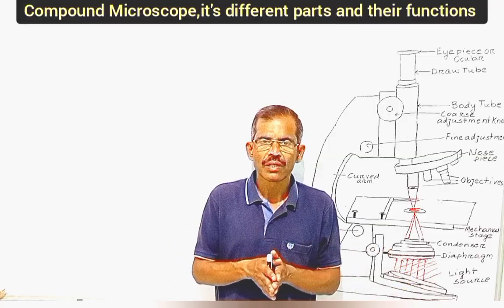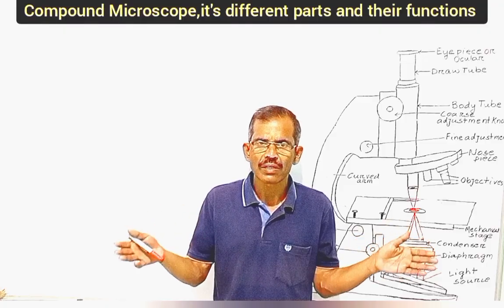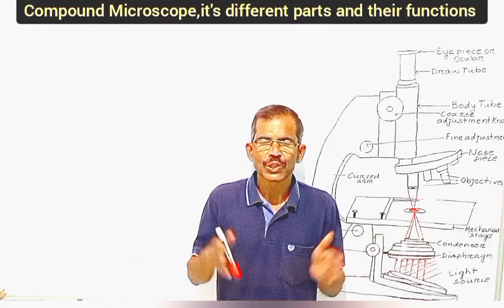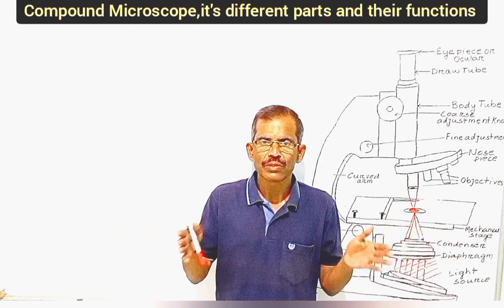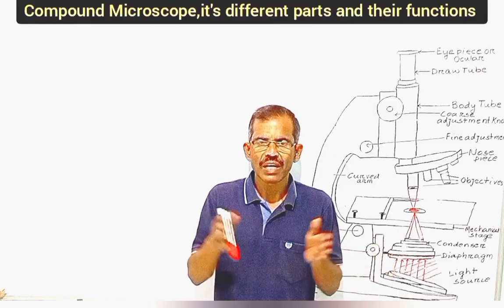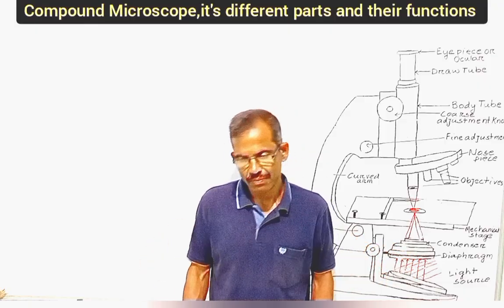In addition, in a phase contrast microscope, a phase plate is present behind the objective lens. This phase plate shifts the phase of direct light by lambda by 4, attenuating its amplitude. Such a type of microscope is therefore useful for examining living and unstained specimens.